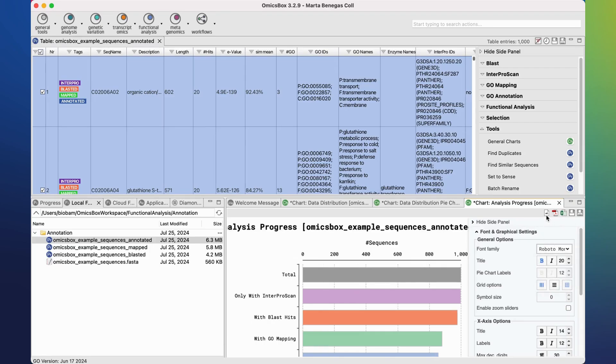They also have different buttons to export them to different formats, like PNG, PDF, text, or save them in .box files.